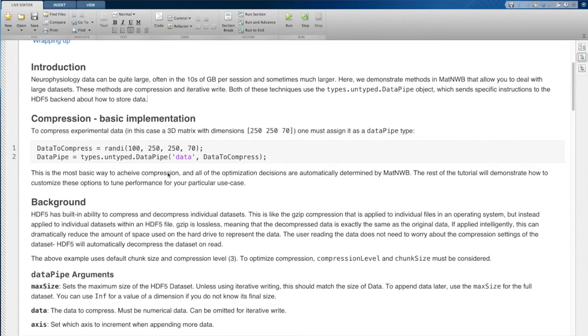This is the most basic way to leverage chunking and compression. All of the chunk settings, including the gzip level, the chunk size, the max size, all of these are going to be set automatically by MATNWB.